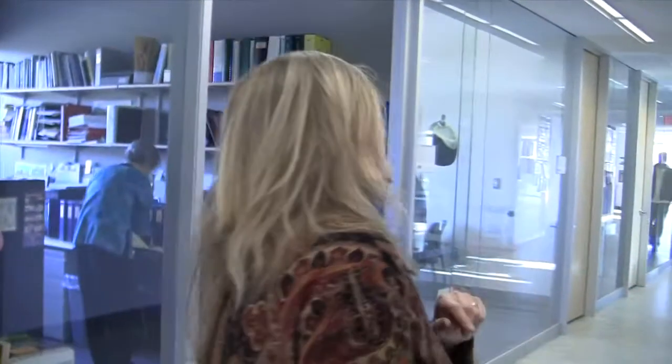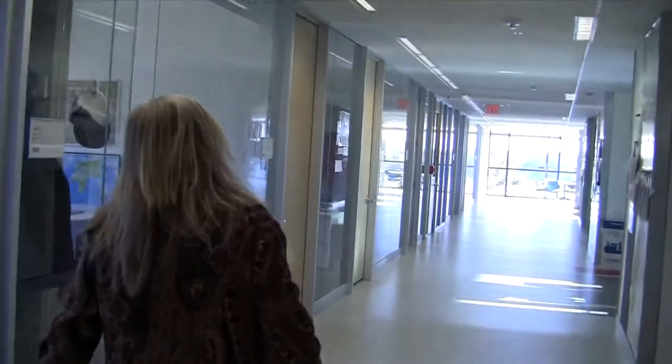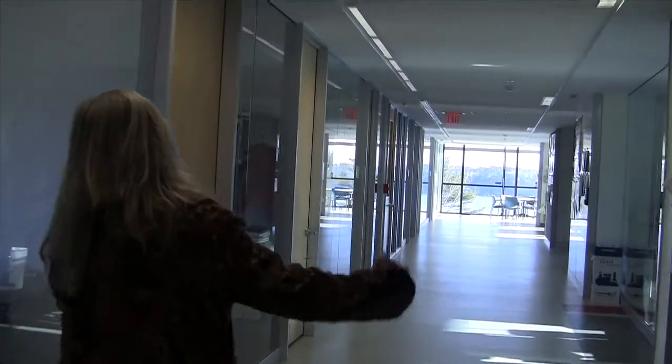Each of those cells contains its own genome. It's a whole world to explore. So they're able to do that here. And flow cytometry is used in biomedical applications as well. But you've got your sample really easily there, and you're not trying to get a piece of the ocean and count the cells in it. This is what is able to do that. So that's a very key technology for the next thing, which is up here.